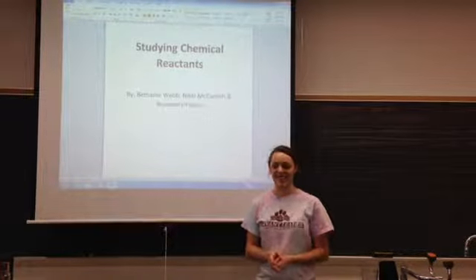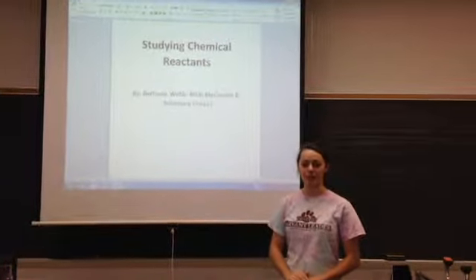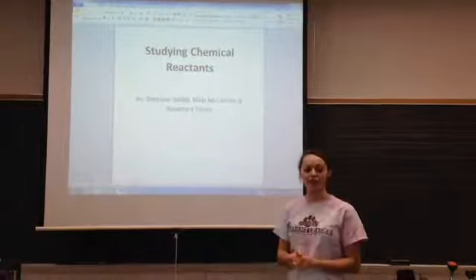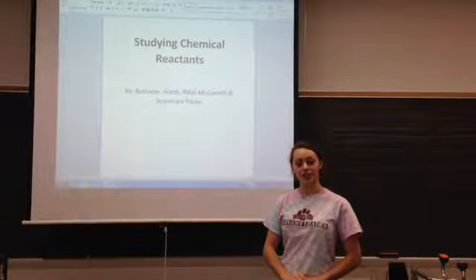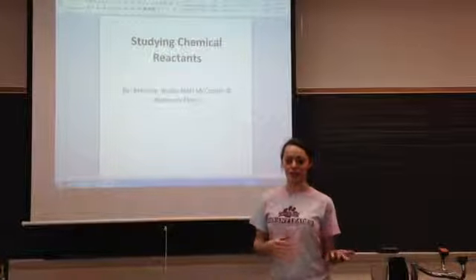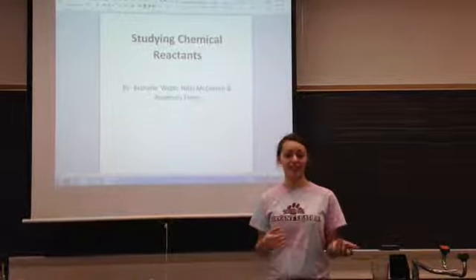Hi, I'm Bethany, and I have conducted an experiment with two of my classmates over studying chemical reactions. So today we've prepared a video for you so you can see what we did throughout this experiment and what we learned from it and how it can apply to even you.